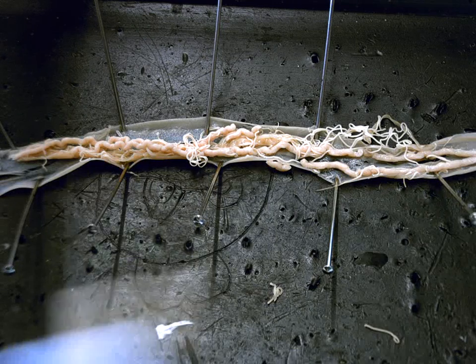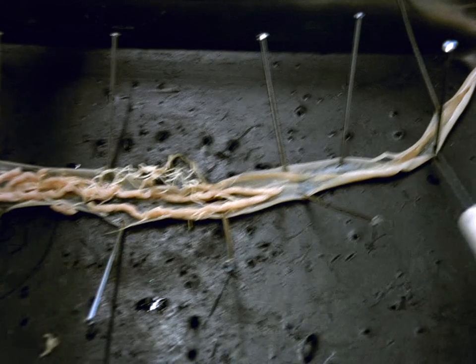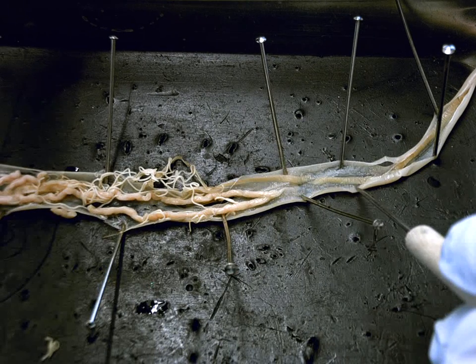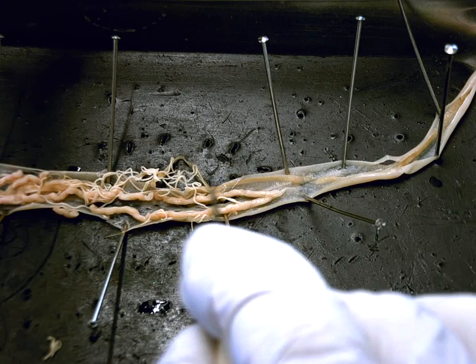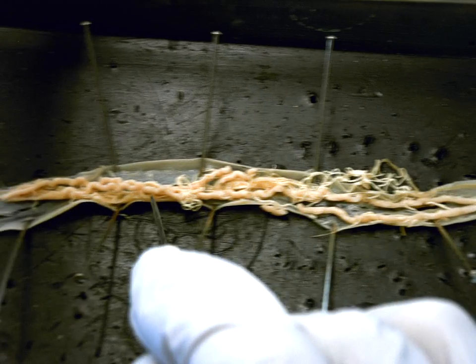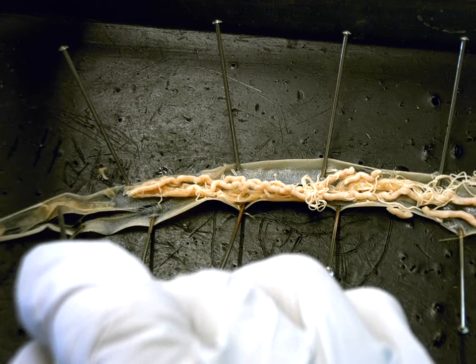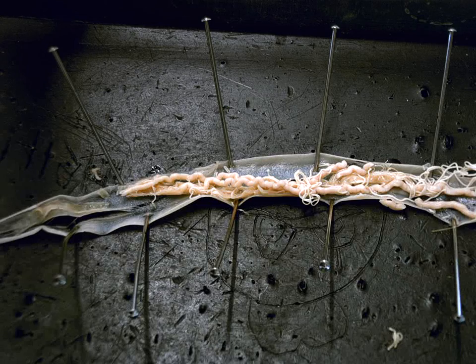So we have the digestive system first, and the digestive will run. If you see way up here, there's this yellowish colored tube, and this digestive tube will run the entire length of the worm, starting at the mouth, and it gets wrapped up here in all this reproductive stuff, and it's going to keep going until we get all the way down here to the posterior end, and we can still see it looks like a flat ribbon-like structure, but a very thin intestine. So that's the one system, head to tail.